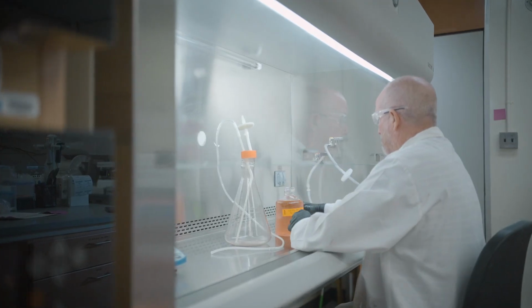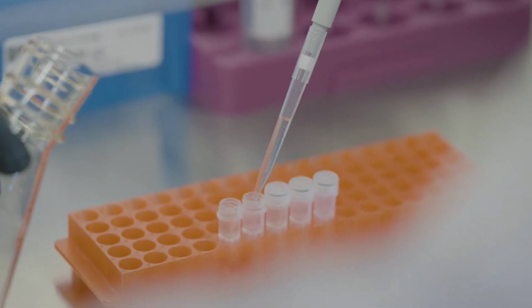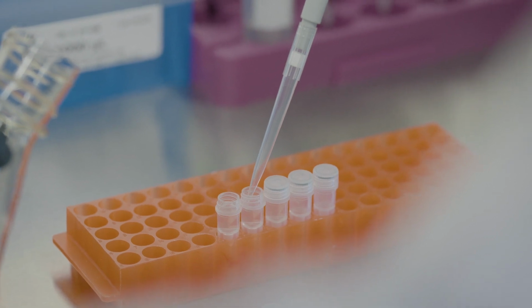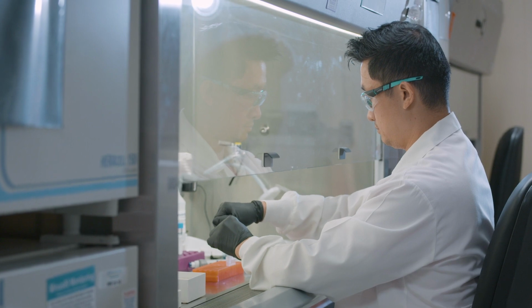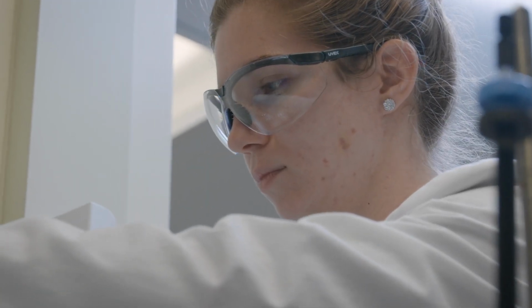The overall goal of process development is to develop a suitable process for the first phase of clinical development. Process development is comprised of 3 teams. Cell line development, so they're responsible for making sure the sequence is correct. Then we have an upstream team, which is responsible for a process that generates the construct at sufficient mass. And then we have a downstream team that is responsible for purifying the molecule.